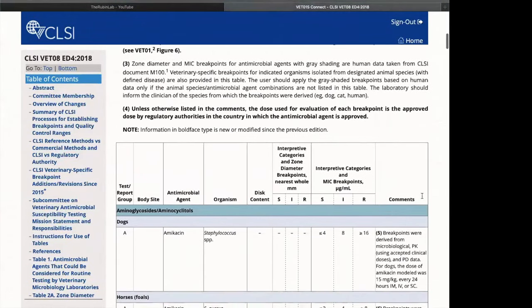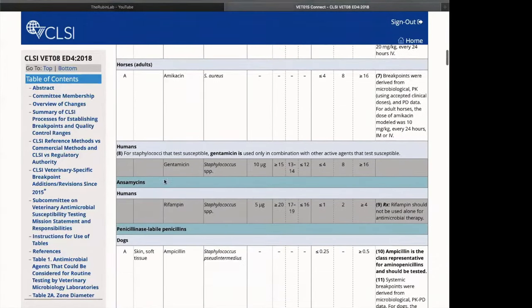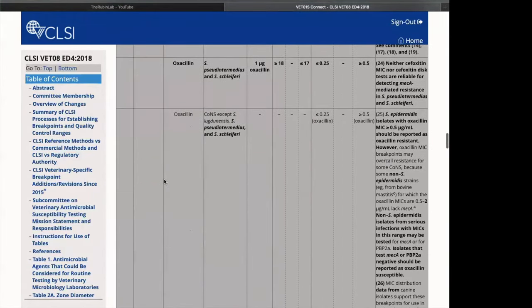As we scroll through the breakpoints, you can see the various interpretive criteria by drug and organism. And we're just going to go down to the cephalosporins as an example.